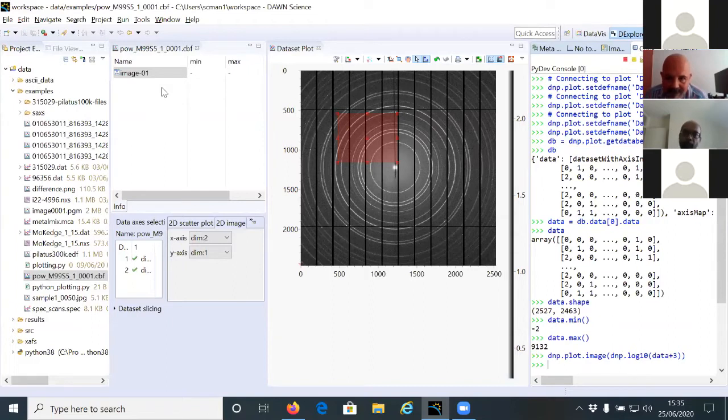At the same time, I don't see much shift in the data points. Do you also shift it? No, they change in place. There is no shifting. Okay, that's it. Good. Thank you. Continue. Yes, so everybody's here.